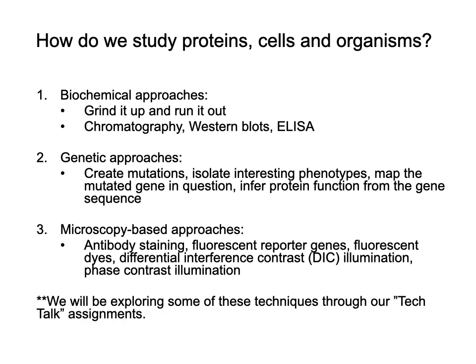It's going to be using fluorescent dyes, either because of antibodies that are tagging to a protein, and those antibodies would have a dye on them, or because we have fused a protein with its gene with a fluorescent protein like GFP. We'll talk a little bit more about that because the last couple slides are figures from a paper that's using the FRAP technique to look at protein dynamics within membranes.